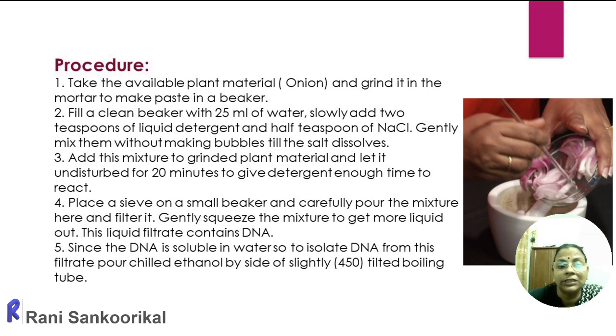So chilled ethanol is very, very essential. So half fill the petri dish, bowl or the test tube with chilled ethanol. Then you have to take the filler. With the help of the filler, take the onion extract.